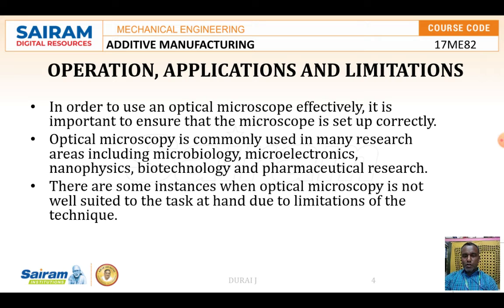Even small viruses, their shapes and sizes, we can look at with the help of the microscope. Even in an aluminum structure, the molecular structure of the particular component, you can go and see with this microscopic device.